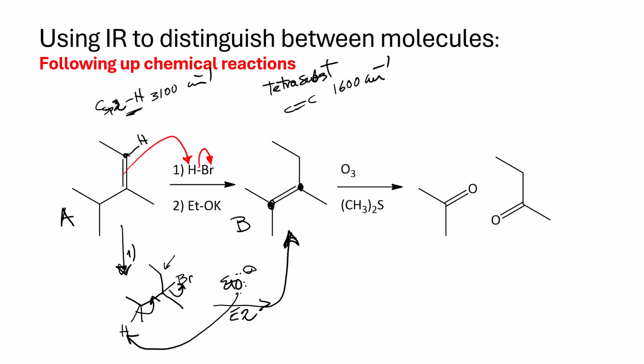And I can monitor the intermediate step, as I said, and say that this is my final step. What is the last reaction doing? That is an ozonolysis reaction. These are the 2 fragments. So what should I see in the product? Well, we're forming carbonyl compounds, a ketone and another ketone. So I should see here the appearance of a band at about 1700 centimeters -1. So I can follow the completion of that reaction doing IR through the different steps and see if the reaction has been completed as desired.